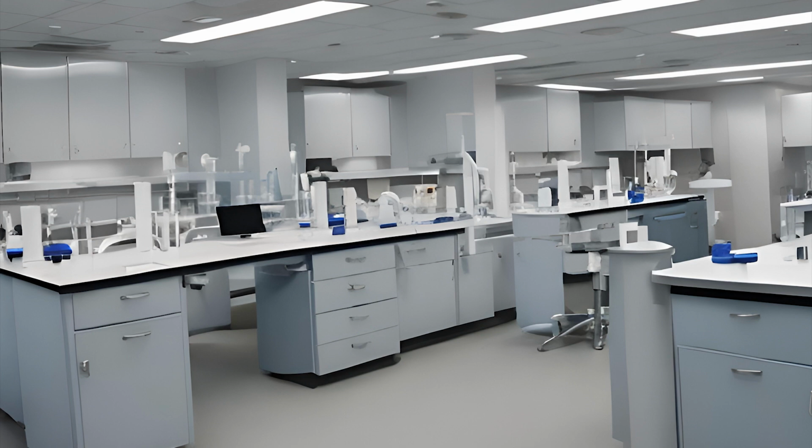Typically, the carriers for holding the tubes will be attached to the rotors. As it spins, that spinning is going to create something called centrifugal force or centripetal force, depending on how you want to refer to it. It's going to create a force that's many times the standard force of gravity, which will accelerate the rate that the sediment will fall out from floating in the whole blood to separate out into its base components. Instead of taking hours to separate, it can be completed within minutes.